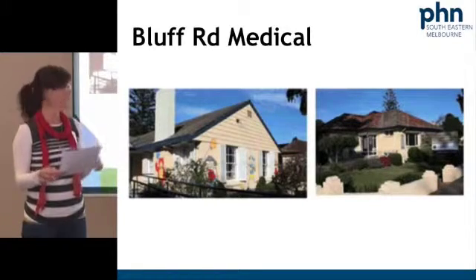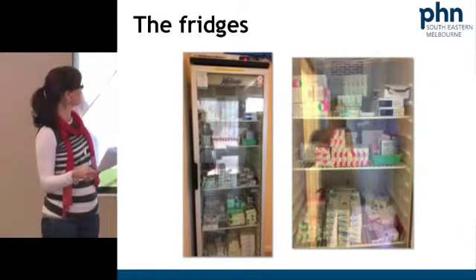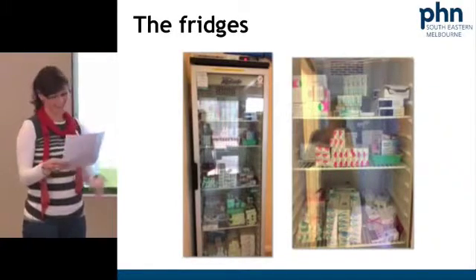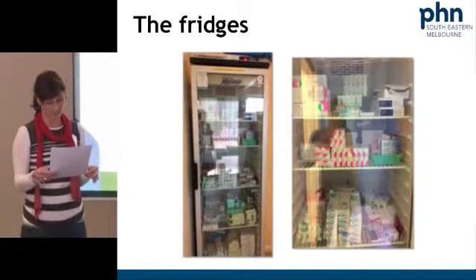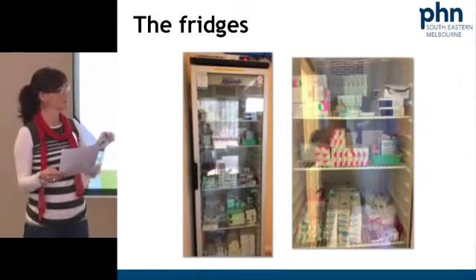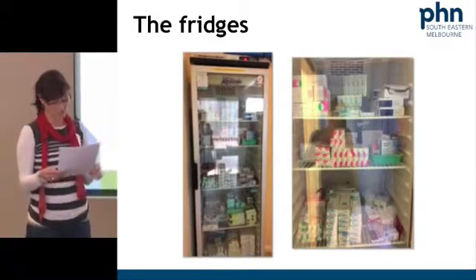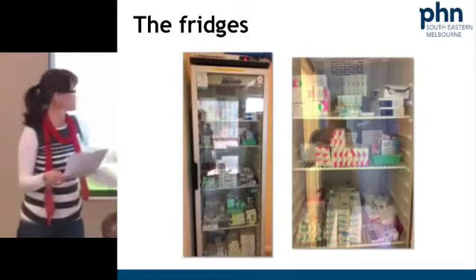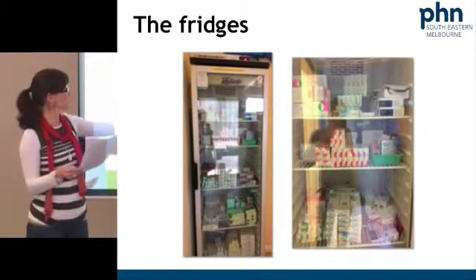The reasons that were given by the company for not complying were: the fridges were measured in 3 different locations, the upper, middle and lower, and it was noted that the fridges were not calibrated to read true temperature. It was noted that the middle shelf in fridge 2, which I'll have to double check on our diagrams, I think it was our travel fridge, that's our government free fridge. Oh no, I think they're both our travel fridge.